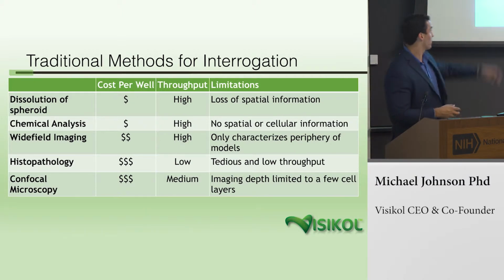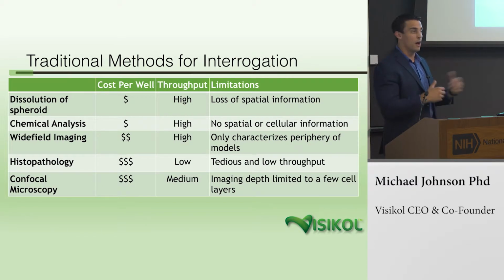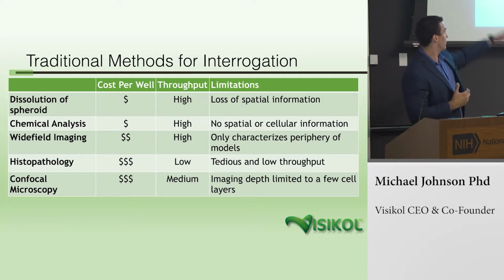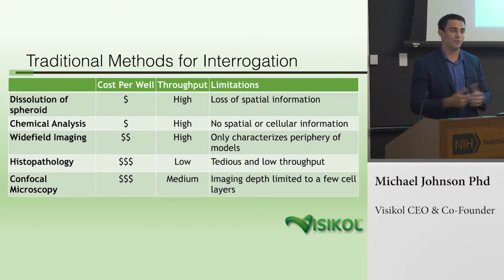So we're stretching here from just a dissolution-based assay, a couple endpoints, all the way up to the three-dimensional imaging of these models and generating huge amounts of data. And in between, we have traditional histopathology, so sectioning 3D cell culture models, which is very tedious, very time-consuming, and also very expensive. But at the end of the day, it all comes down to the research question you're trying to address.